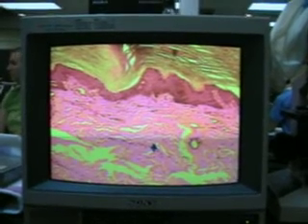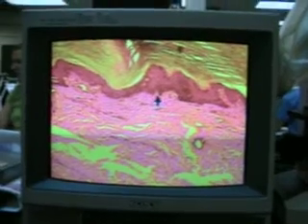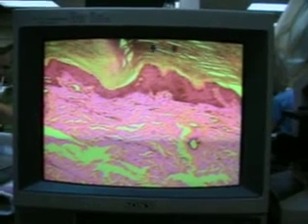All right, so the main thing that distinguishes thick skin from thin skin, as we mentioned, is how thick the epidermis is. And so that is the live cell layers here, and then the dead cell husk layers up here. And so this is your stratum corneum, as you can see, and then this is the epidermis that gave rise. This whole area is called the epidermis, okay? But this particular layer, the stratum corneum, is distinguished by not having any nuclei, and so you're not getting the same staining characteristic.